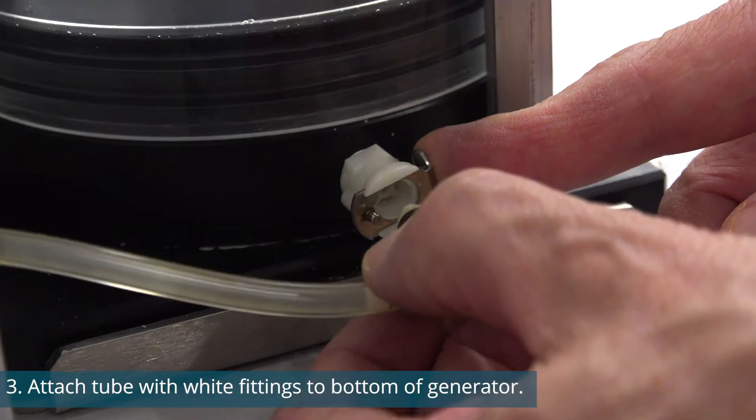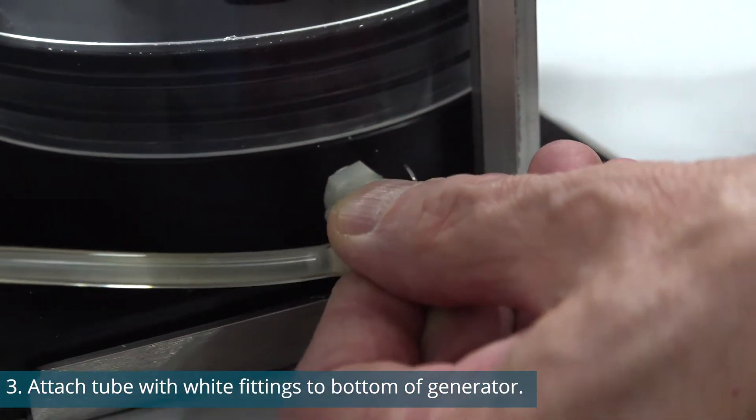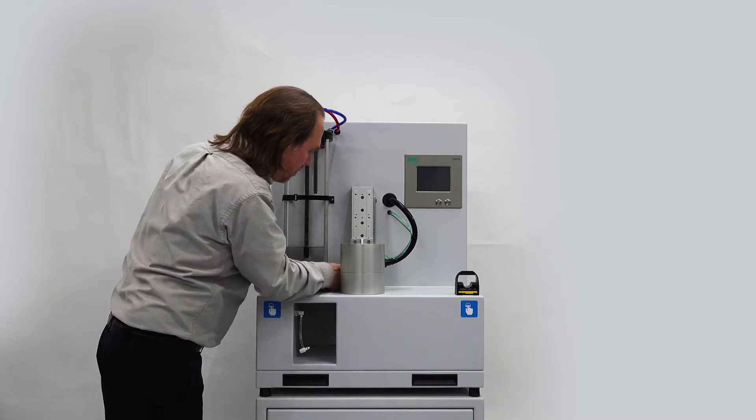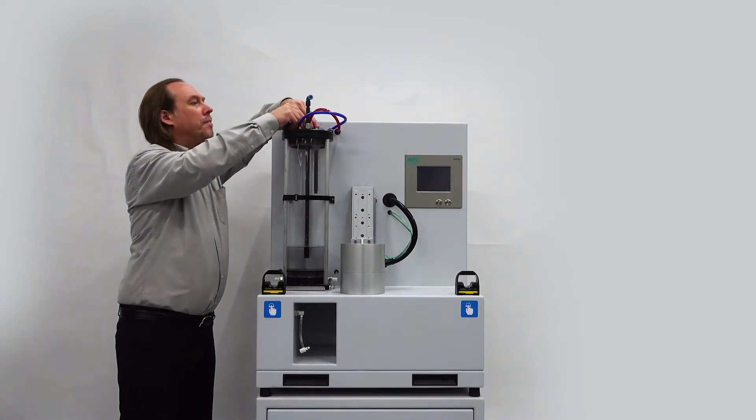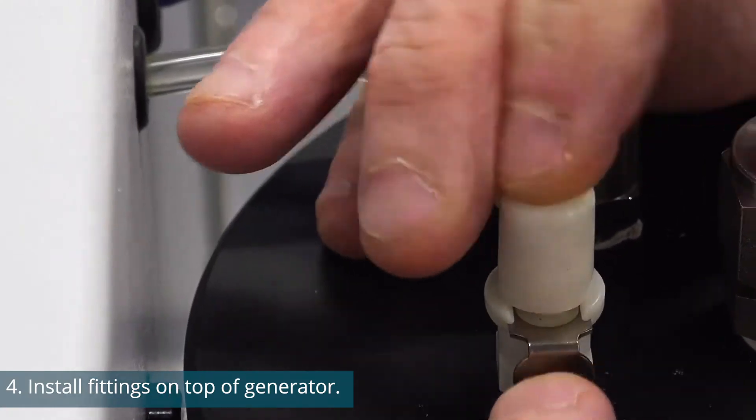Next, attach the two clear tubes with white fittings to the bottom of either side of the generator. Now install the fittings on the top of the generator. The fittings are color-coded for ease of installation.